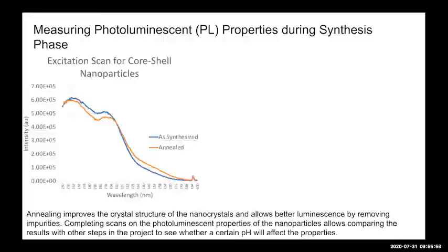The profile of the excitation scan for the nanoparticles is somewhat similar to previous studies. However, it's a little bit different because in this project the PL properties were scanned in powder form, while in previous studies it was done in solution.